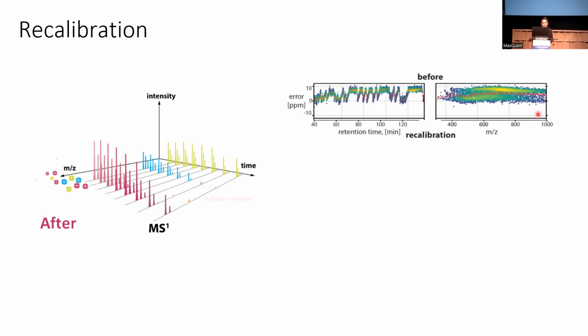Actually, I think you also do it for the intensity for non-Orbitrap instruments. But yeah, let's keep it easy. So we have these plots again for the m over z dependent plot. You see that there are also some wiggly lines. It's not around 0, for example. So of course you have to do something about it.